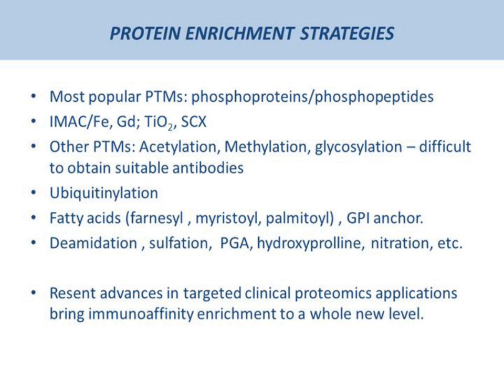Although currently not as popular, there are methods to enrich for glycosylated proteins or proteins carrying other specific post-translational modifications. Moreover, enrichment strategies are becoming even more significant for targeted proteomic workflows as proteomics enters its clinical phase. As custom antibody development becomes more affordable and reasonably fast, more antibody-based product kits are entering the market.